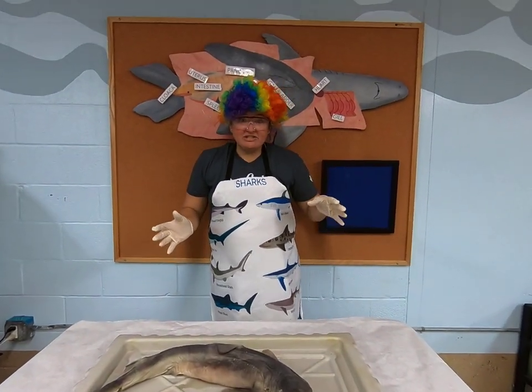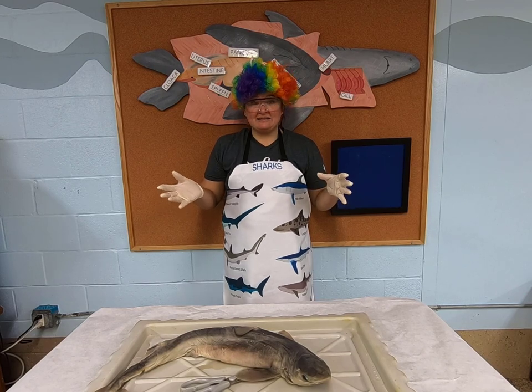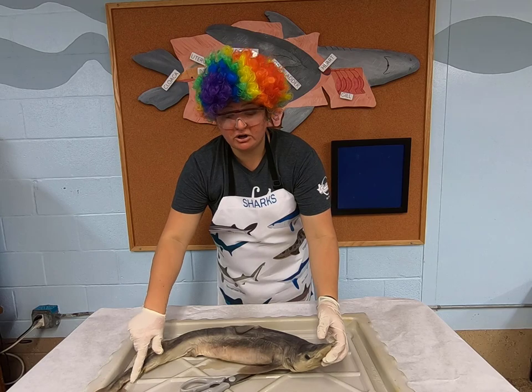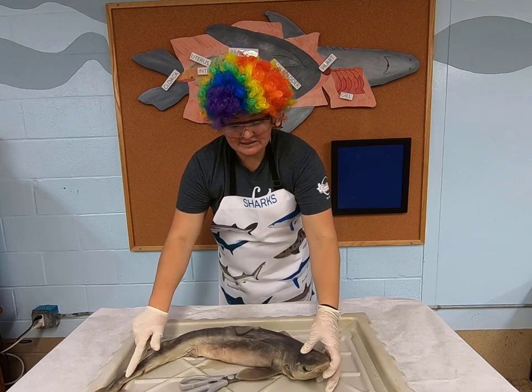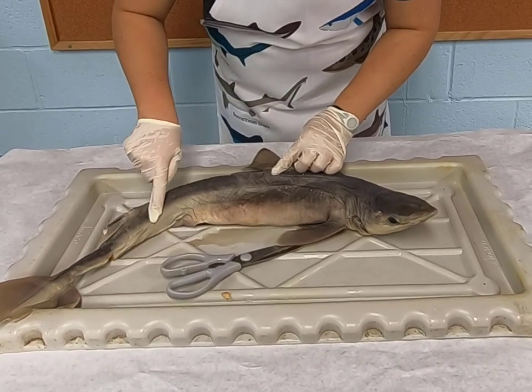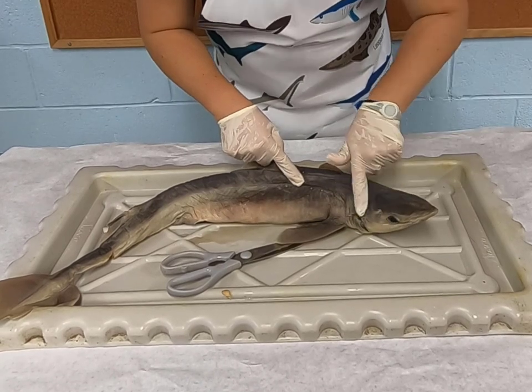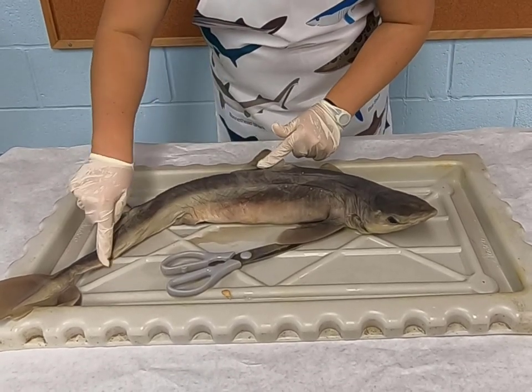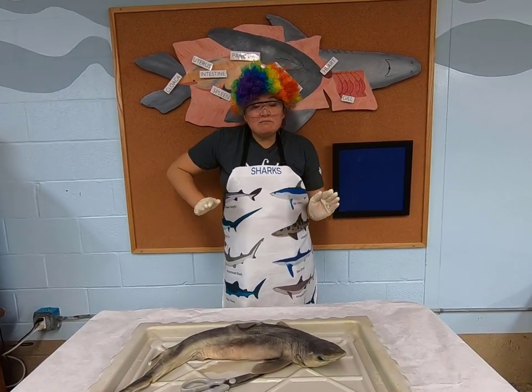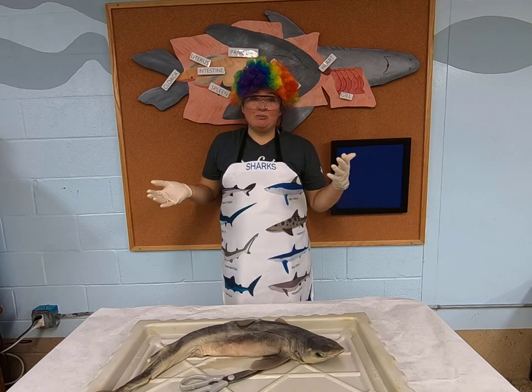Sharks do have a sense of touch. They have a system called the lateral line system that goes from their snout all the way down to the base of their tail. And so this lateral line system, it's kind of hard to see on this shark, but you kind of see this line right here. There's a series of pores that connect with the face. It goes all the way along, and these pores have one little hair in them, and they can sense the movement of the water.